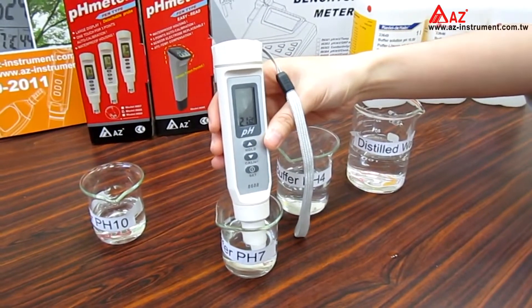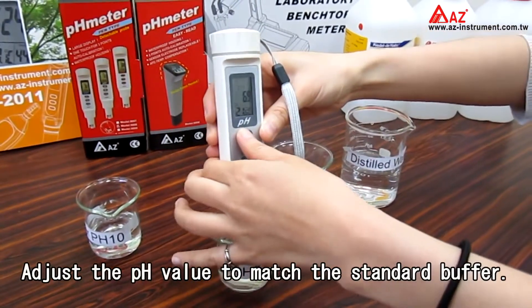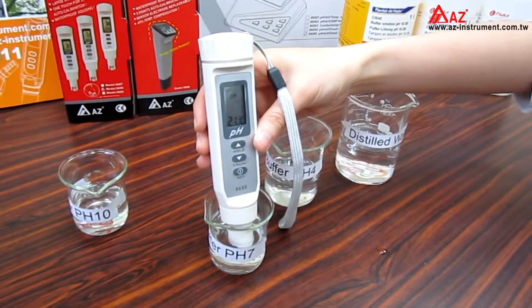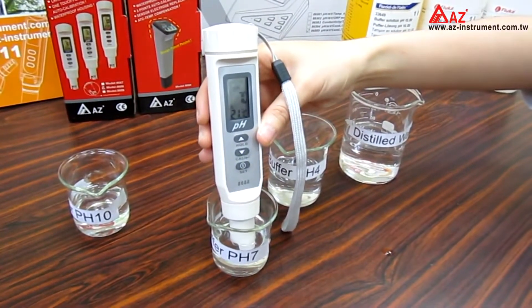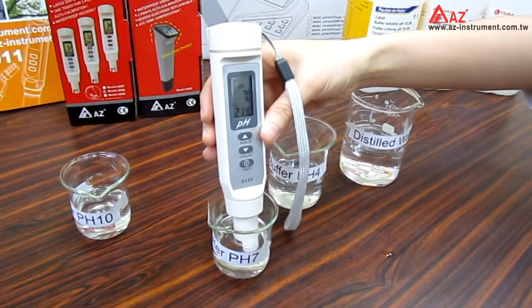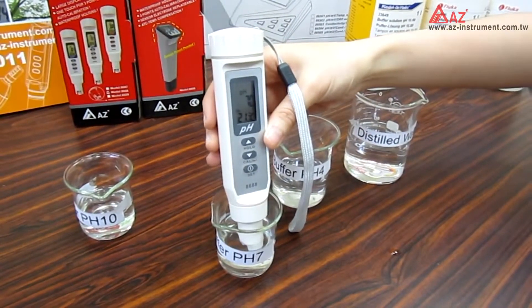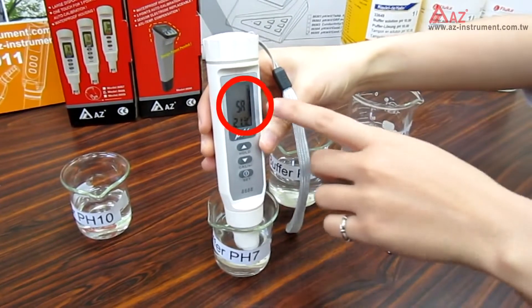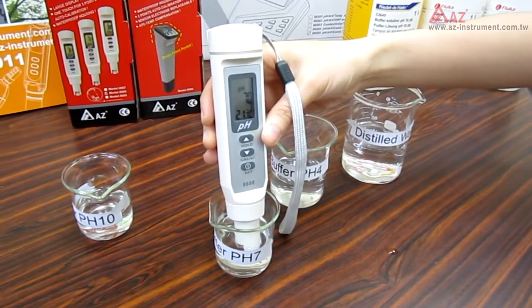The meter will recognize the buffer in the middle range. Adjust the pH value to match the standard buffer — I'll tune it to 7. Wait for 30 seconds until the reading gets stable. It will display a star on the LCD when it completes the calibration. Now we have done the pH 7 calibration.